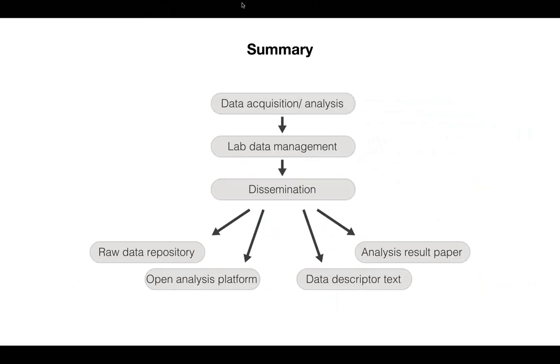So in summary, I hope I gave a very brief progress report on our analysis and sharing of a proteome dynamics data set. I think this could be a good way to share proteomics and maybe mass spec-based metabolomics data in the future, namely having both the raw mass spec files and search results on either ProteomeXchange or PRIDE or some other repository, while at the same time releasing the analysis in tidy data tables and code on Synapse or similar platforms, perhaps to accompany any publication.